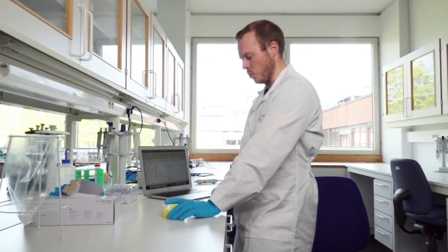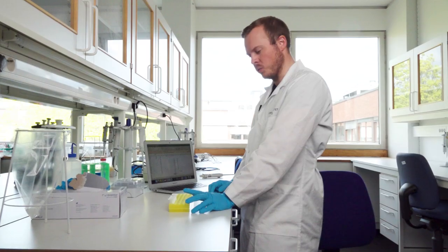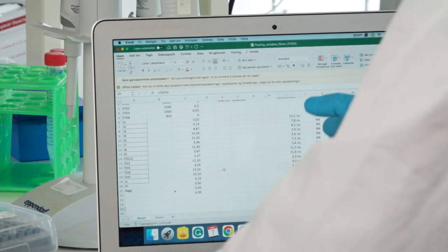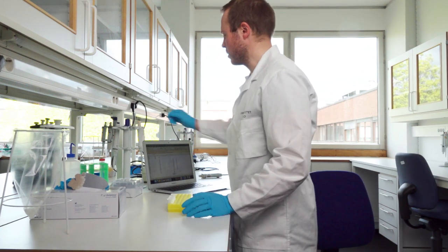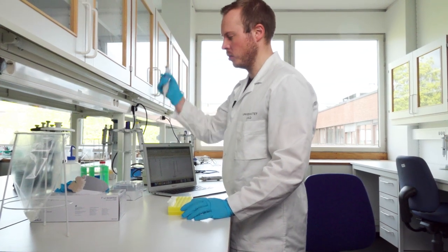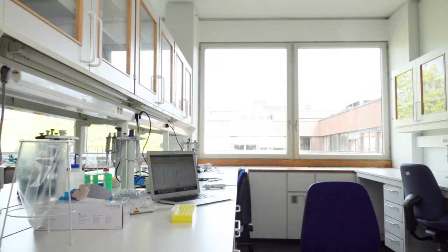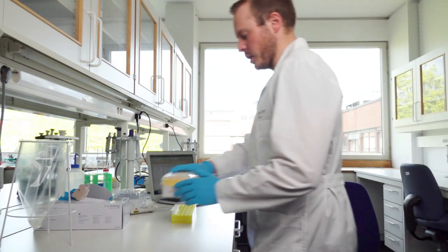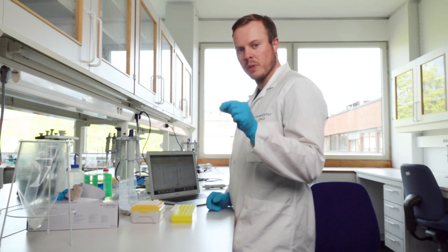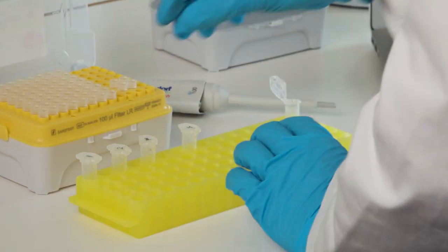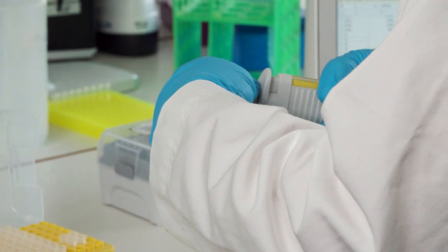And here we have some example samples. Say that this that I called sample one corresponds to T one here. Here I see that this has a concentration of 3.02 nanograms. And to get 40 nanograms of DNA into the pool, I need to take out 13.2. So that's the volume I need. So then I need a 100 microliter pipette, and then I need a pipette tip, and I need a tube. I have another tube that's going to be my pool. And then I turn this to 13.2.